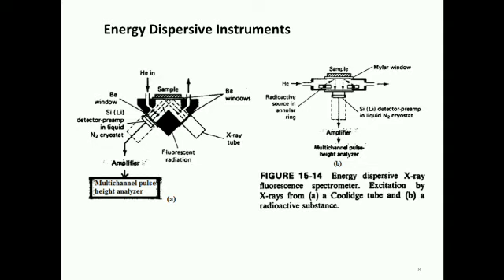There is an absence of collimators, and this system gives an increase in energy reaching the detector. In this instrument we can use a weaker source of radioactive material or a low power X-ray tube.